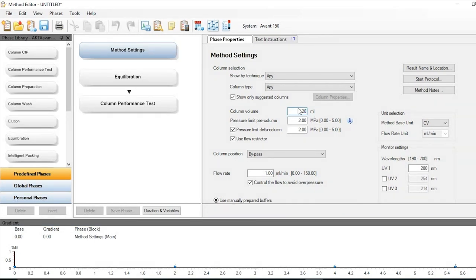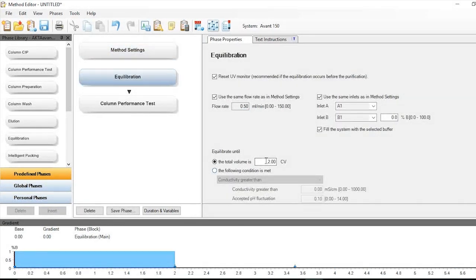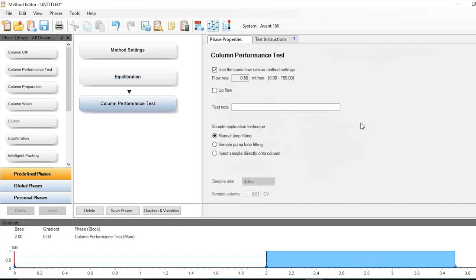Here, Superdex 75 prep grade was packed in an XK 16 over 70 column to a volume of 120 milliliters, so that the pressure limits were set accordingly and the sample volume was set to 1.2 milliliters.